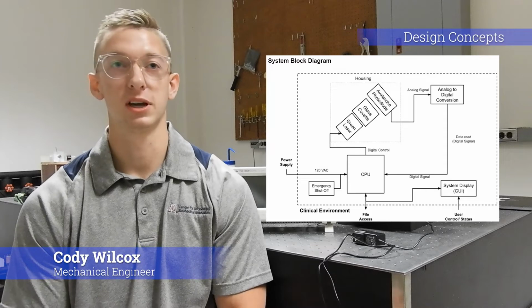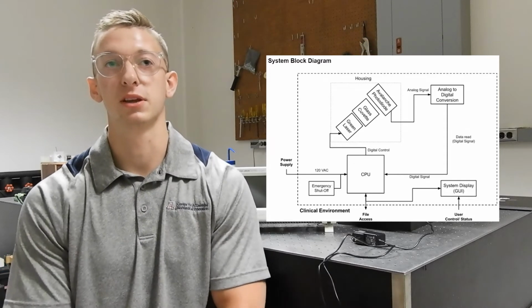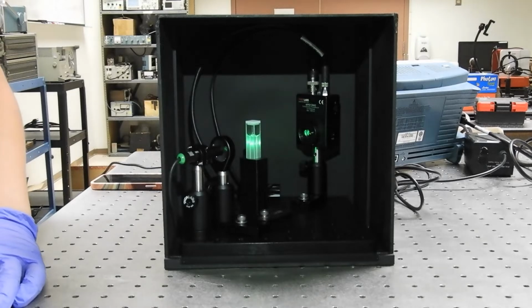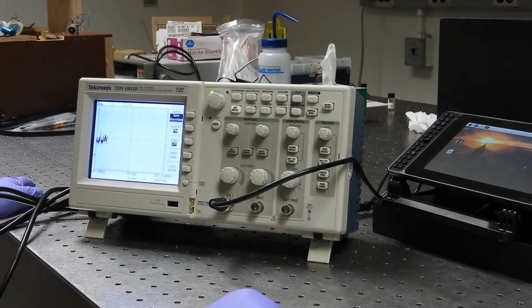The overall system design is made up of a 520 nanometer compact laser module that shines through a plano convex lens with a focal point of 5 centimeters and then passes through an unfrosted cuvette containing a microparticle sample. The lens ensures that the light rays meet at the center of the cuvette to reduce the size of the beam before finally reaching the avalanche photodiode. That reads the varying changes of light intensity over time with the help of an oscilloscope.